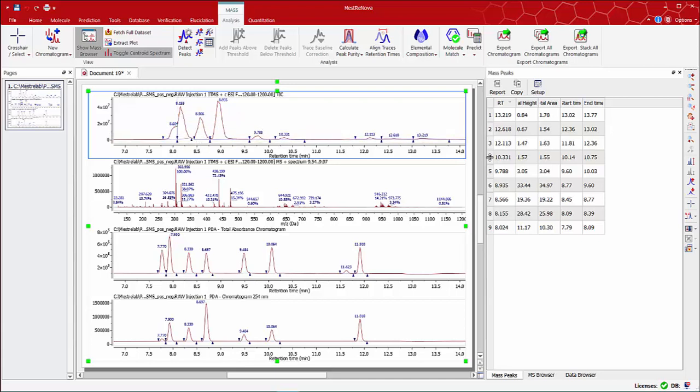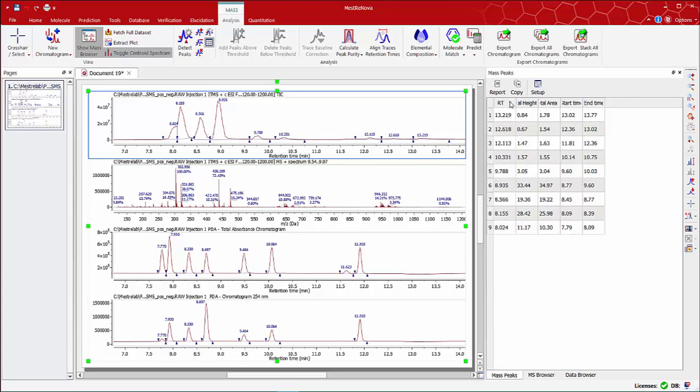The table is then automatically updated. You can sort the peaks by retention time or by any of the other entries in the table.